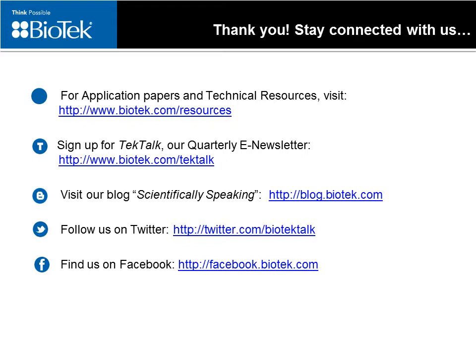A question about focusing on floating objects or debris instead of cells at the bottom. I would recommend using autofocusing techniques, ideally laser autofocus, to get really accurate, consistent focusing of these cells. And that's what I've done in the experiments described here. In those cases, the system is able to very effectively avoid focusing on debris, producing consistent in-focus images throughout the experiments.